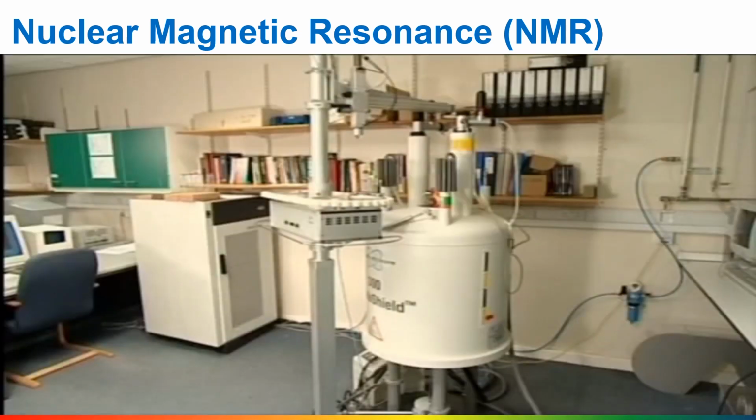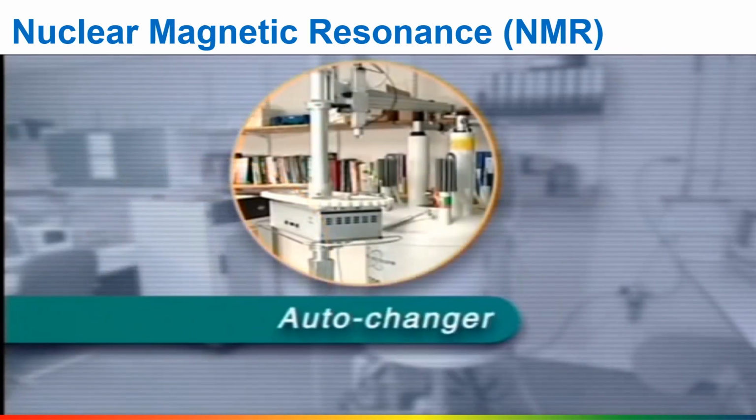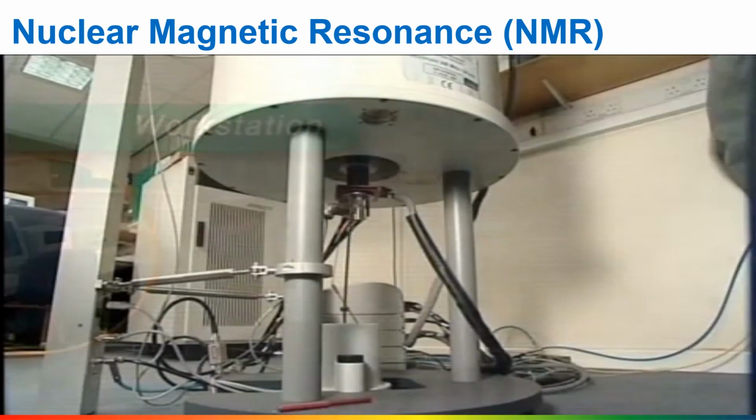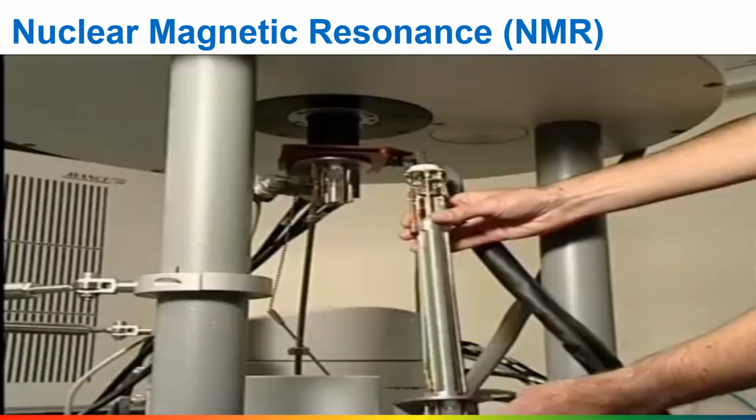The electronics which generate and interpret the radio signals are housed in the boxes to the left. Samples are placed in the machine and removed from it by the auto changer, which takes the samples in turn from the carousel. The instrument is controlled from this workstation. This bare probe shows the radio coils and where the sample sits.